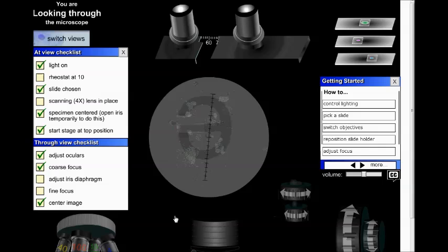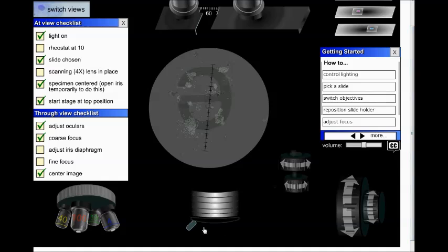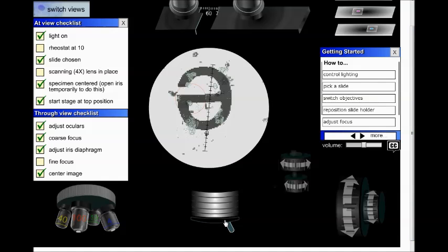To the 10. And you'll see it's bigger. I need to adjust a few things. First, it's okay in the center. It could be a little better, but it's all right. I'm going to mess a little bit with the fine tune, but I will do that after I adjust the light. And that is so true in the classroom with a real microscope. The light is so significant.